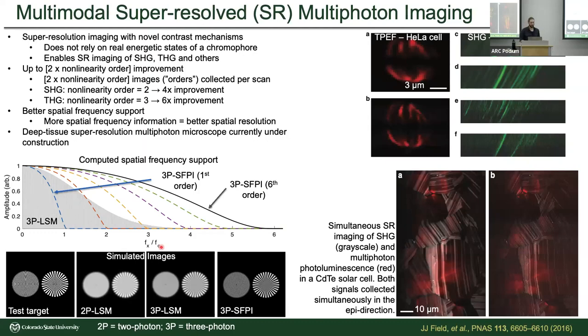Why does that matter? Well, we talked about before, confocal microscopy always has multiphoton, 2-photon beat by a factor of 2, 3-photon beat by a factor of 3. In this modality, it turns out that we can buy that resolution back. And so the upshot is we can do fluorescence imaging well below the surface of tissue. So maybe 300, 400, 500 microns deep, but with confocal resolution.